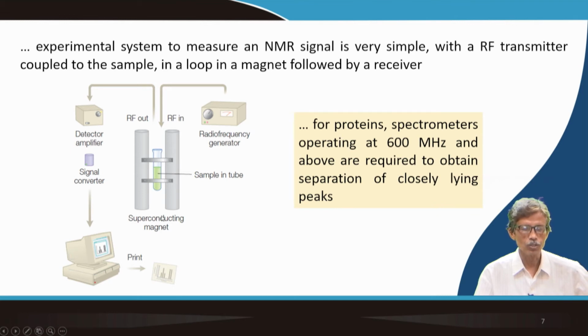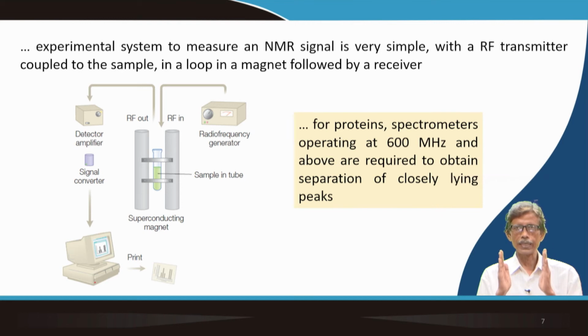within the magnetic field. This is a superconducting magnet. If you have the superconducting magnet like the two magnet poles, you have this particular cavity with the magnet poles over there, and the radio frequency gets absorbed, and due to the relaxation process, the excited molecules coming down to the ground state, you have the corresponding signature of how much radio frequency is getting absorbed. So, RF in is the incoming radio frequency, and RF out is the corresponding transmitted radio frequency after absorption.